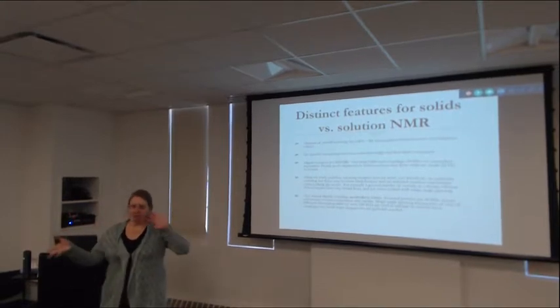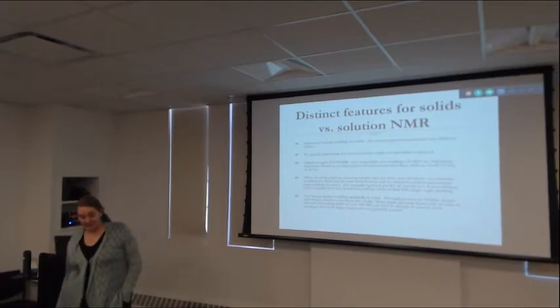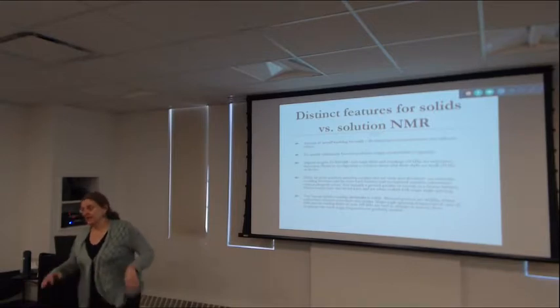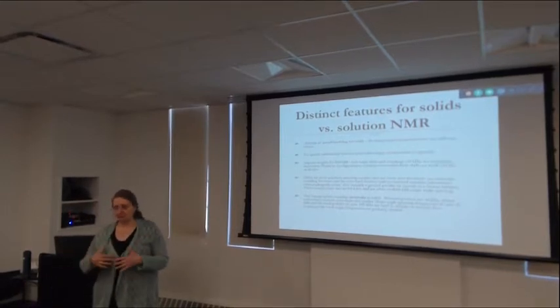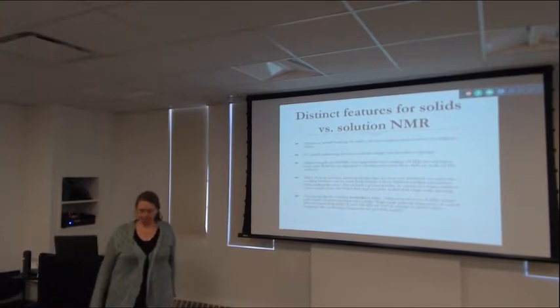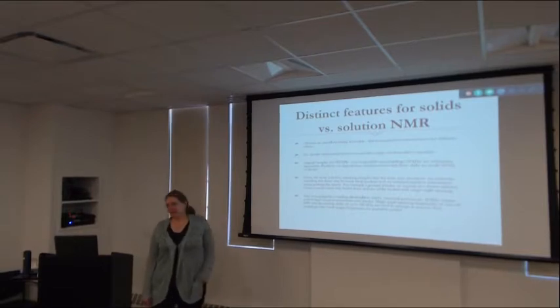Beautiful, symmetric equations, lots of nice conclusions, but the reality, and most of the samples that we study for proteins, is not one coupling. It's a network. And it may not even be an isolated cluster. It might be a quasi-infinite network. That's where the complications come in. And we end up wanting to remove those couplings from most of our experiments.